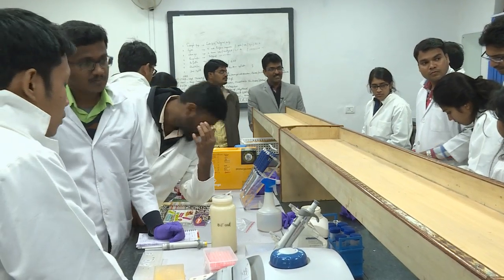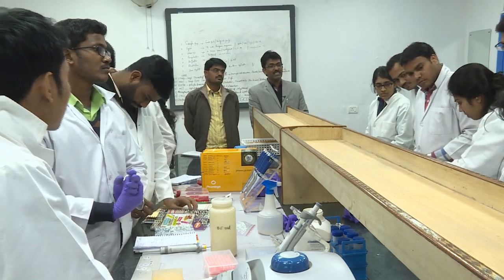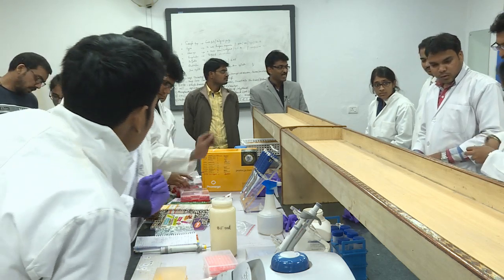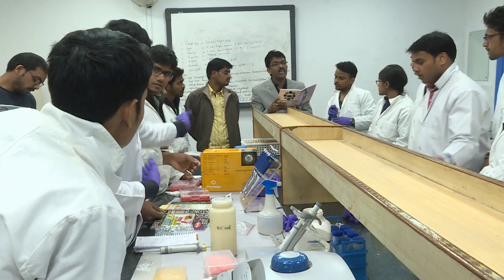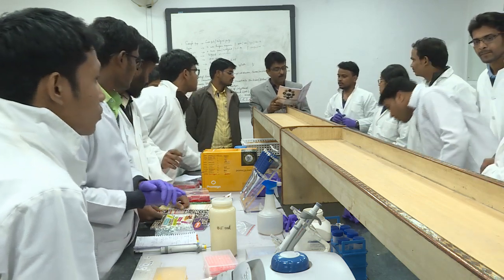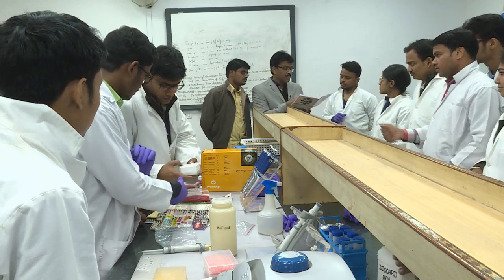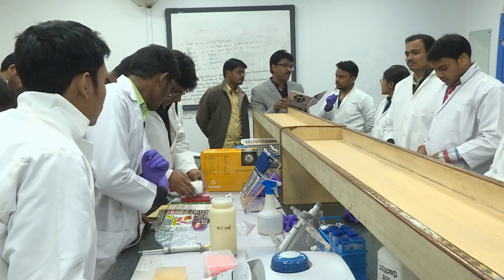Okay, what is the reading? Give it to me. That's what I was waiting here. So the 4th group has come out with the reading 462.4 nanograms per microliter and 721.8 nanograms per microliter. You make 200 nanograms per microliter stock DNA and go for PCR now.